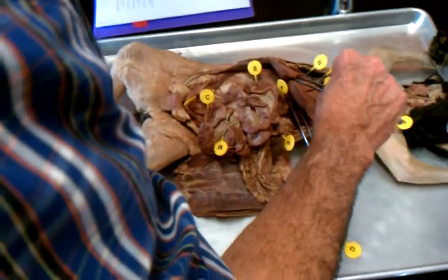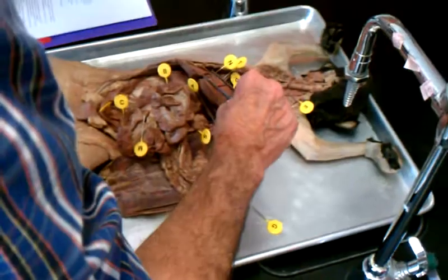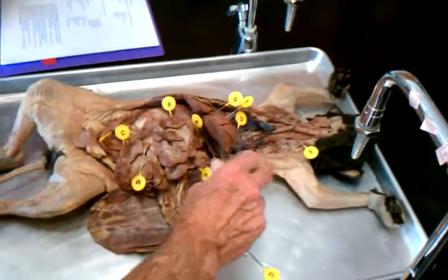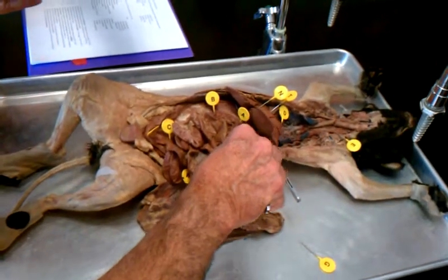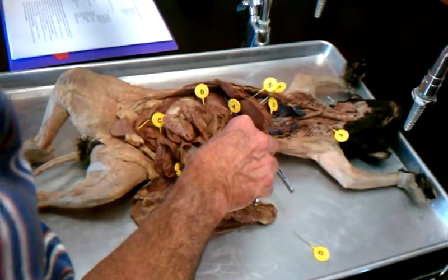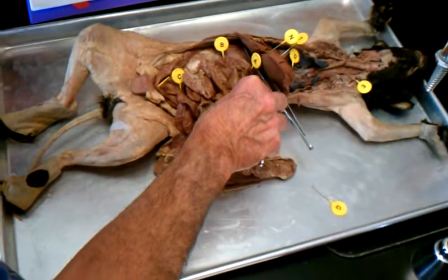And between two of the lobes is the gallbladder. The little pin in is in the gallbladder. Down below the liver, you find the stomach, and so this tube right here, it's got a J-shaped stomach. At the bottom of the stomach is the pylorus, and it ends with the pyloric sphincter. And from that point down, this is the duodenum of the small intestine.